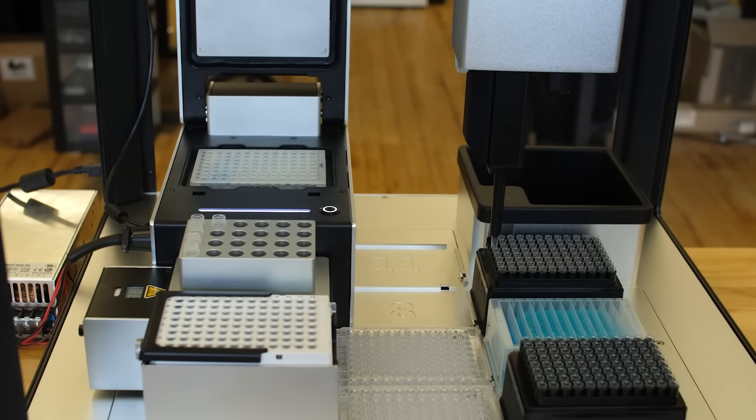In future videos in this series I'll be covering the labware, the pipettes, the modules, and the software that the robot uses so you have an idea of exactly what to expect once you get the robot into your lab.